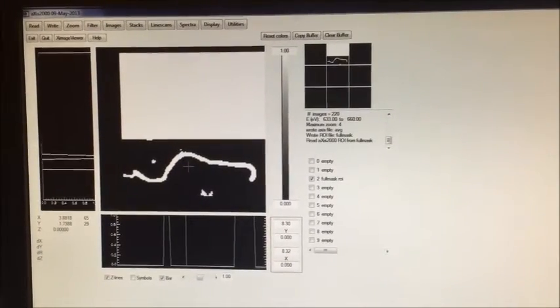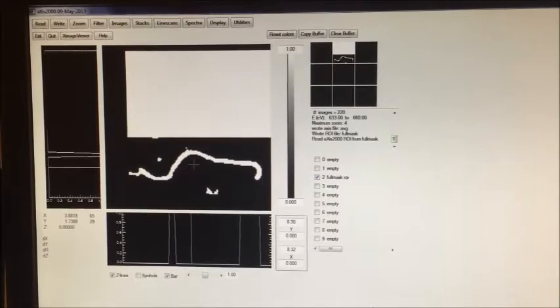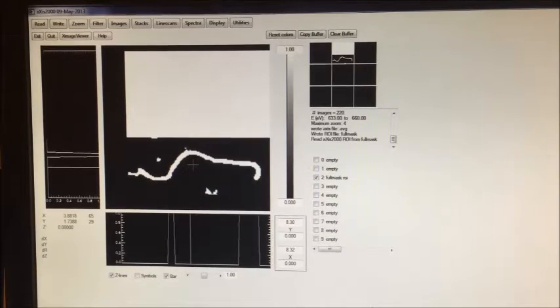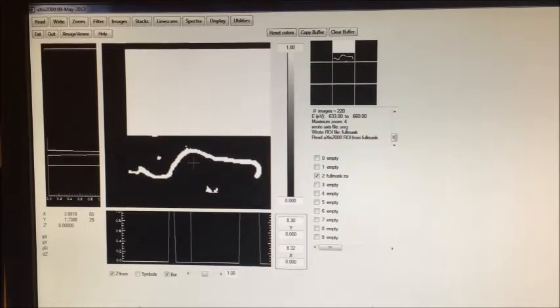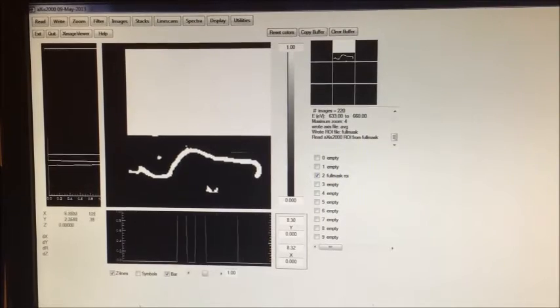Okay, you can see here. If you want the final X-ray spectrum from the full region of the nanowire, you can stop it and go back to the optical density stack. But if you want the spectra from a particular region of the nanowire, let us say from this particular region, I'm going to delete the other region.